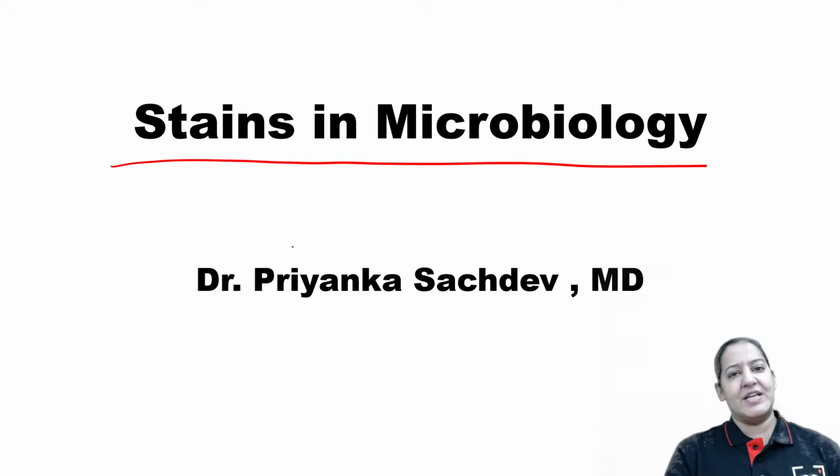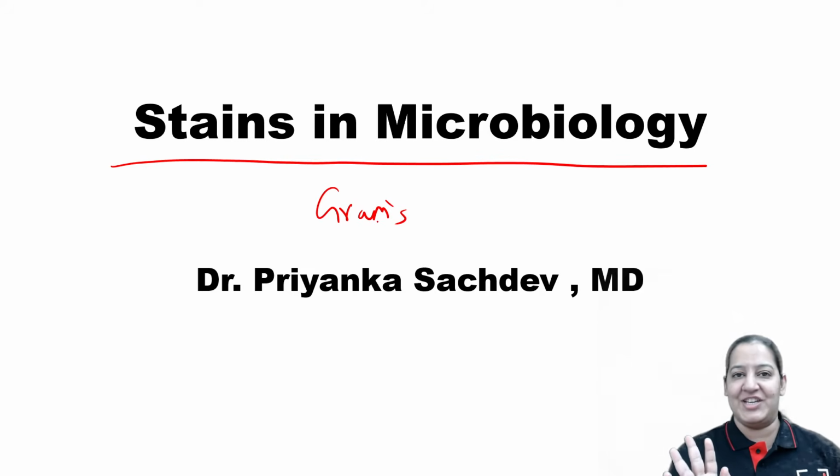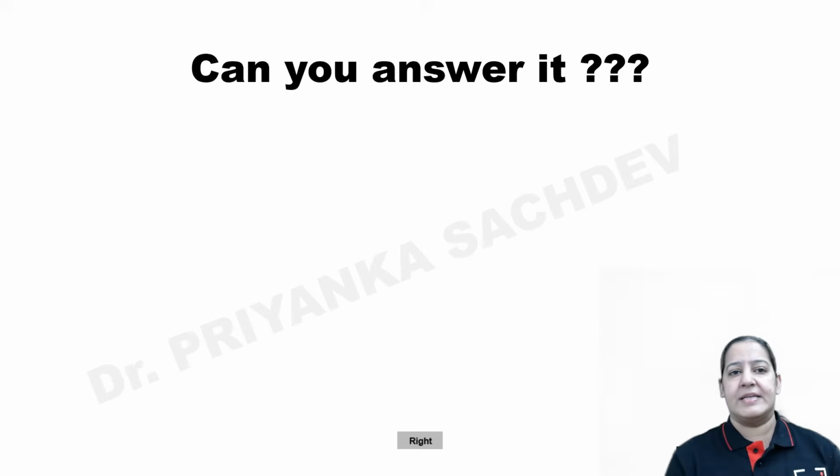There are many types of stains in microbiology. We will be studying all of them one by one. But today I am going to teach you gram staining in detail in this session. Everything about gram staining, and some other stains also.